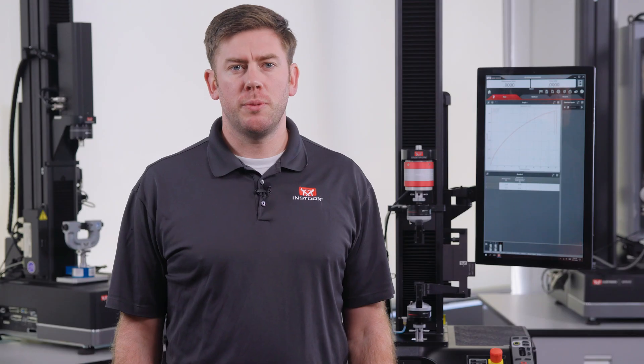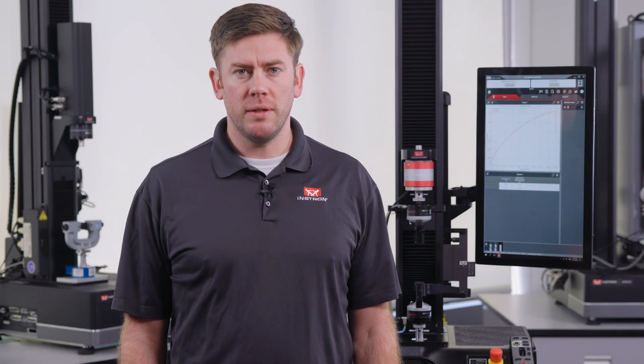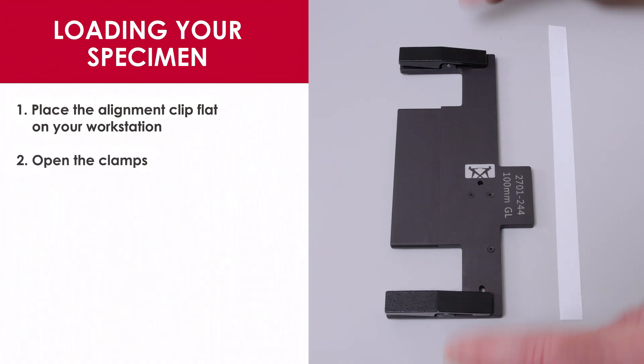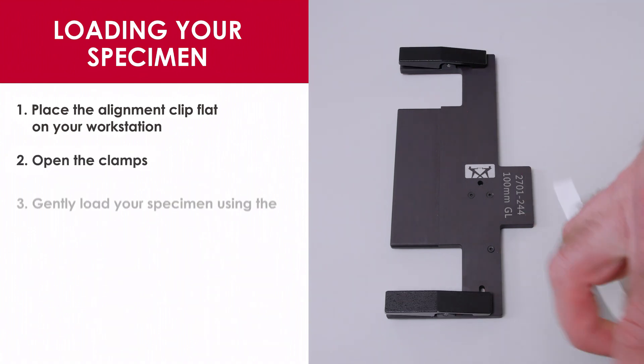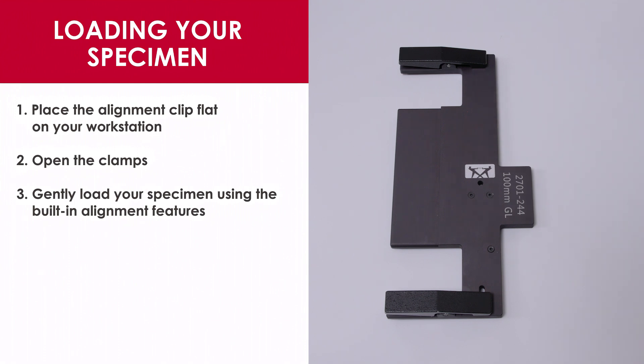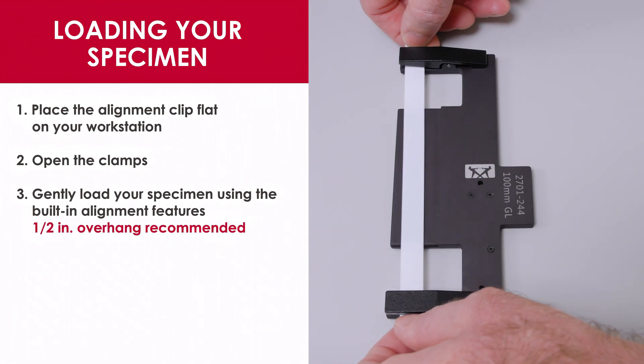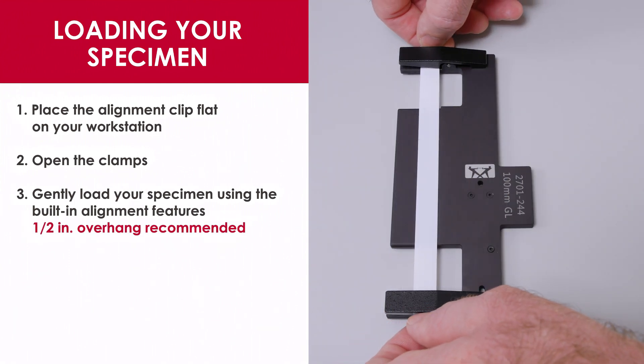Using the precision specimen loader is easy. Simply put the alignment clip flat on your workstation, open the clamps, which stay open using magnets, then gently load your specimen using the built-in alignment features. We recommend having approximately half an inch of overhang on both sides to make it easier.